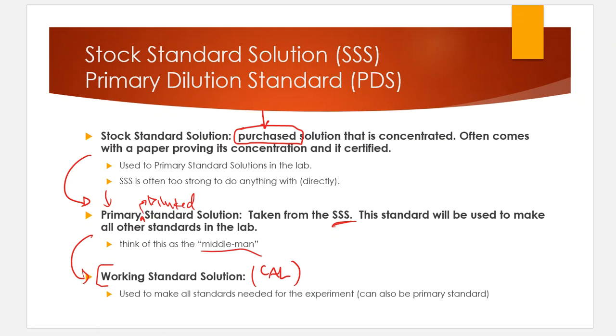So we give you these directions. We give you these definitions. This is our primary. This is what we're going to make every other calibration curve with, standard-wise. That's perfectly fine. But there could be extras that get into this mix as well, and I don't want you to be surprised with that if that goes on. So the SOP is going to tell you that information. They will define that the way that they want to define it, meaning they're letting the laboratory make that decision.